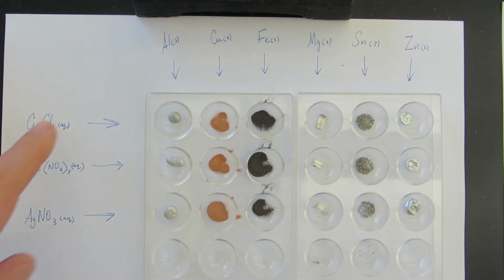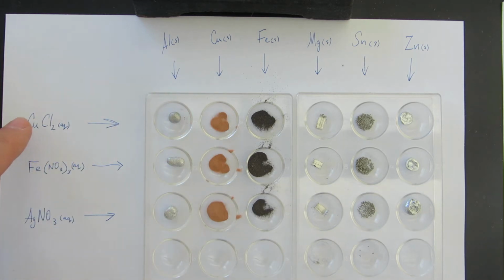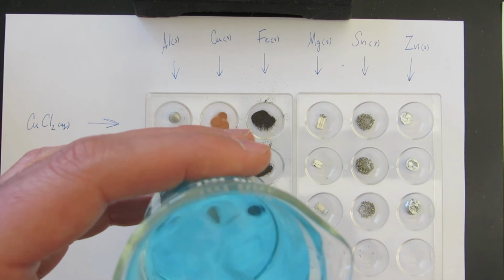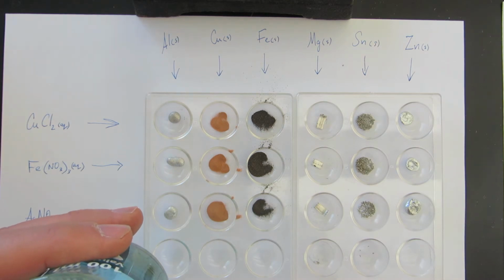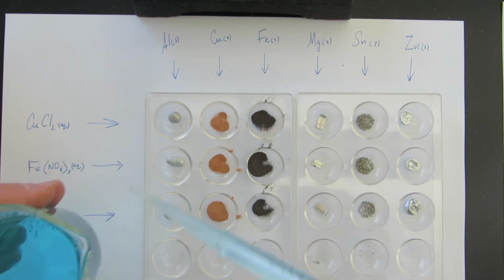What we're looking to see is, are these metals more reactive than the metals that are in the compounds? So you see these aqueous signs, you see them all the time in equations, and just what that means is that it's dissolved in water. So this is some copper chloride, and I'm going to go ahead and add this to all of them. Some of the reactions are fast, some of them are slow, so we'll see what we see.